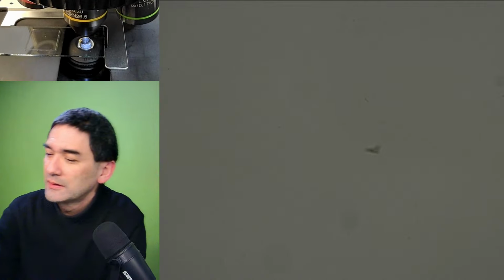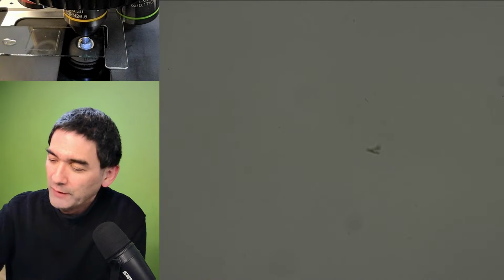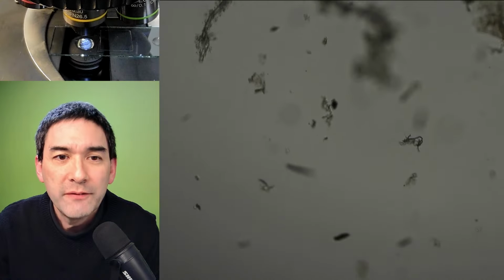Okay, let me try this again. You see, I tried this before. I found so many fibers, and for whatever reason, not anymore. That's what you call a demonstration effect.